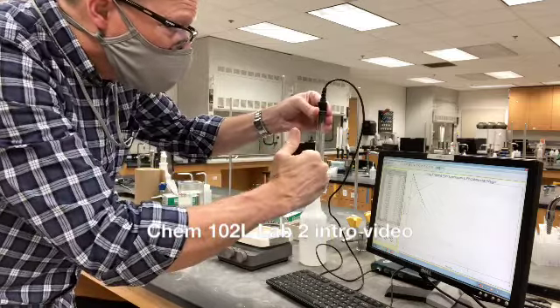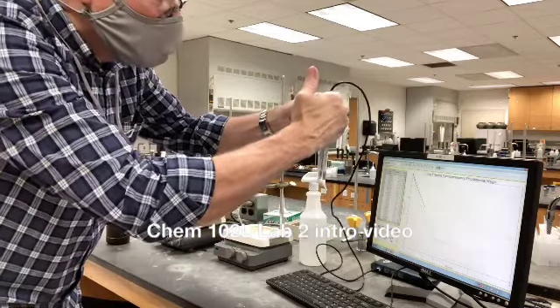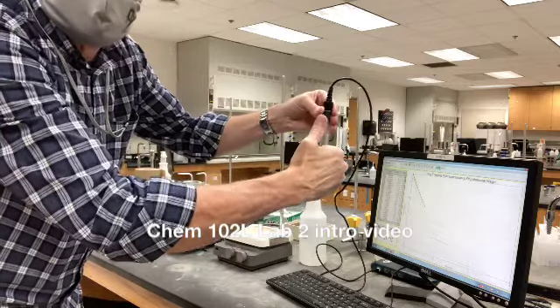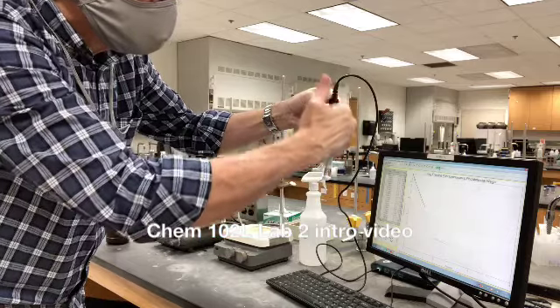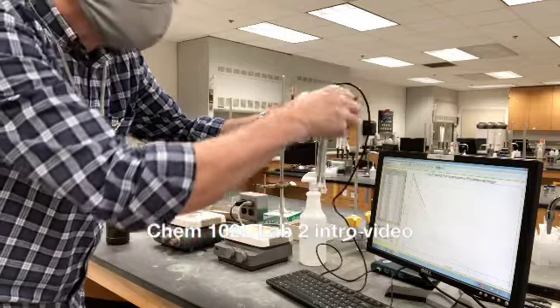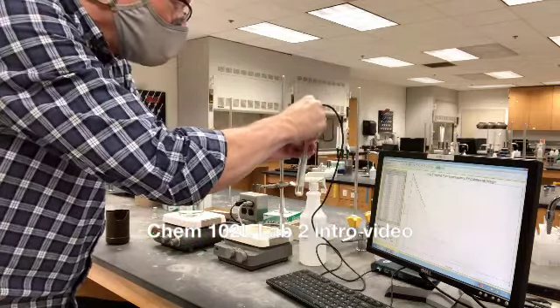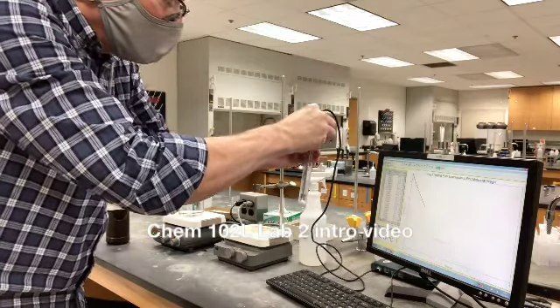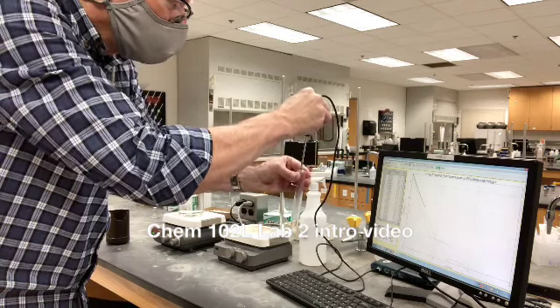So one trick is that I want you to try to avoid getting some of this liquid spread along the side of the tube. We're going to add some of the solute, and we want that solute to drop down and get into the liquid. And if we have much stuck on the sides, that solute will get stuck on the sides of the test tube and not get mixed into the mixture.